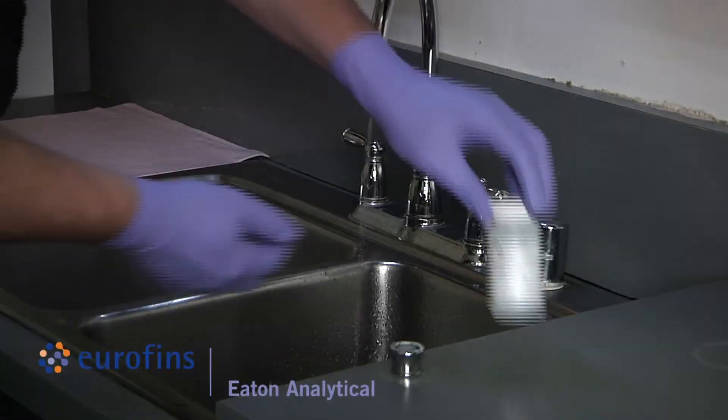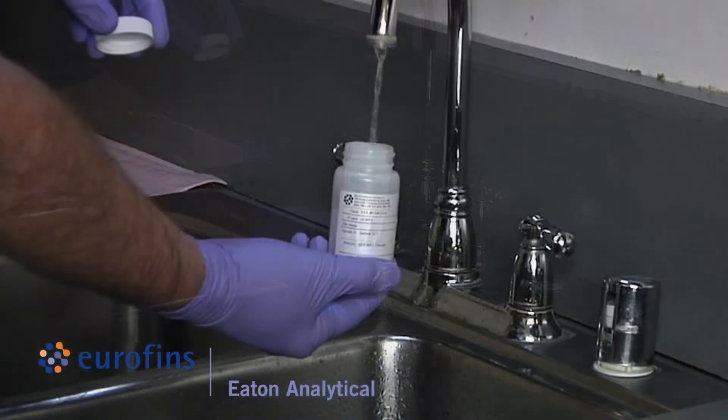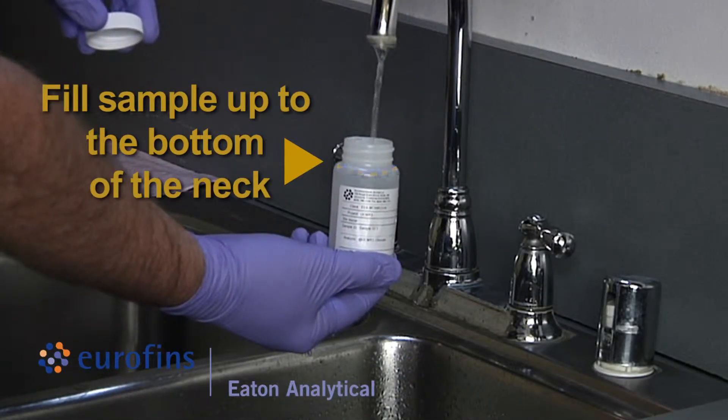Start sample collection by filling the sample bottle up to the bottom of the neck, taking care not to flush out preservatives and making sure the mouth of the bottle does not come in contact with anything other than sample water.